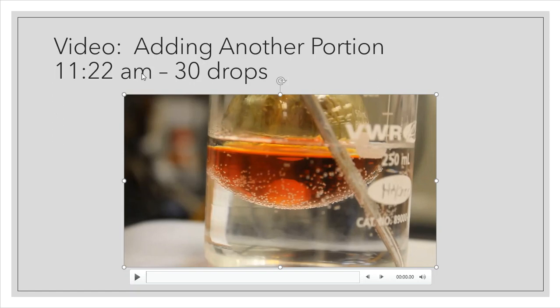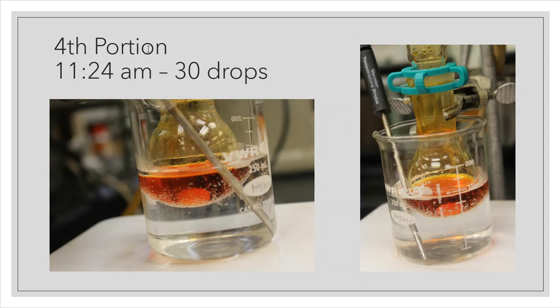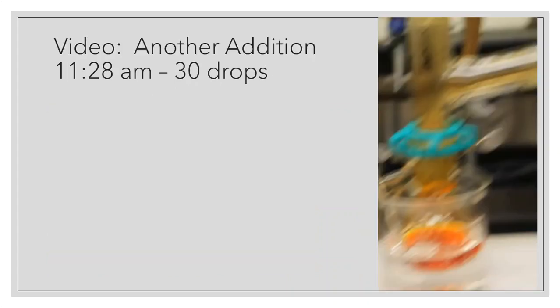All right, guys, so I think I misspoke on the actual number of portions that that was, because here was the actual fourth portion. This fourth portion happened at 11:24 a.m. It was another 30 drops, and then finally, I thought that I was going to be at my last addition. It's not, but this is closer toward the end, and this is another addition of another 30 drops at this point, and I still had liquid bromine left in that separatory funnel, so I still needed to go further.